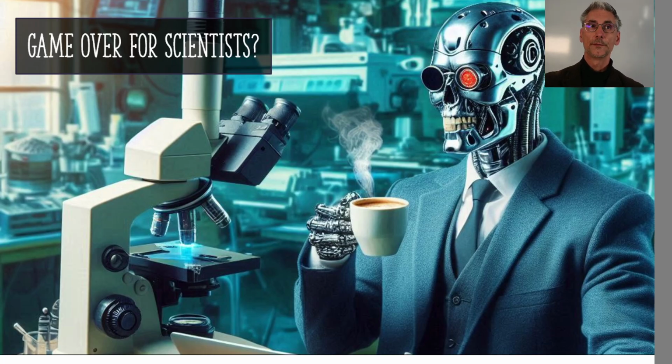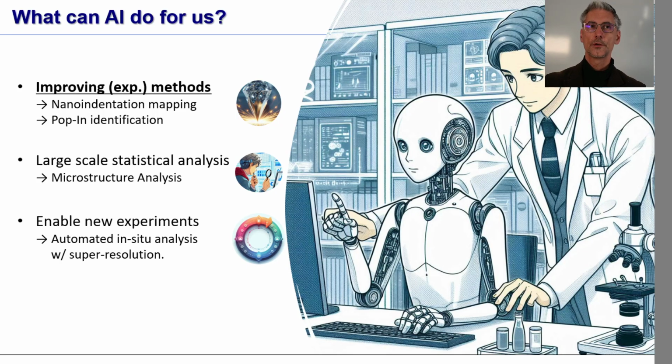So, what does that mean for a scientist? Game over? Let's turn the question around and say, what can AI do for us? Rather than seeing it as a threat, let's see it as an opportunity. We'll focus on a few examples here. For example, improving experimental methods, and here we focus on nano-indentation mapping and pop-in identification. Then large-scale statistical analysis, and here we focus on microstructure analysis, or how to enable new kinds of experiments that weren't feasible without using AI methods.